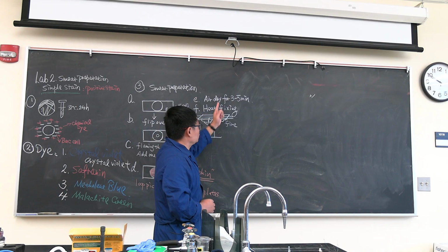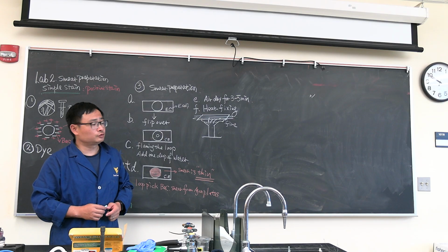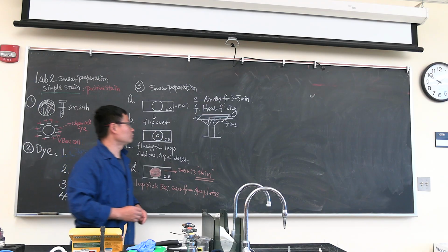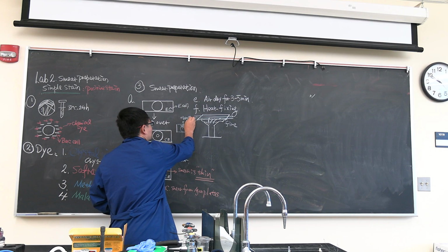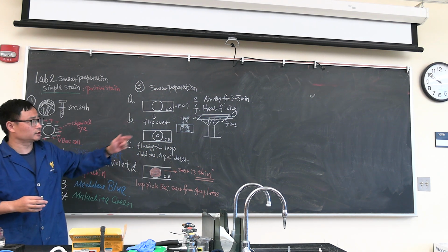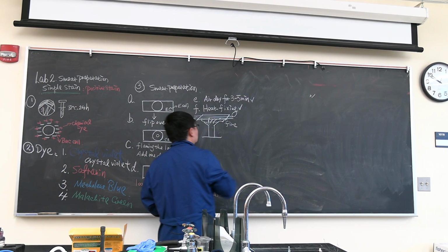Something I want to mention, we need to do the air dry first, then do the heat fixing. If we do not finish the completely air dry, and directly move to heat fixing, what happened? The glass slides later on underneath the microscope, you will see lots of things like this. Lots of legs will come out. So air dry and heat fixing are two very important steps.